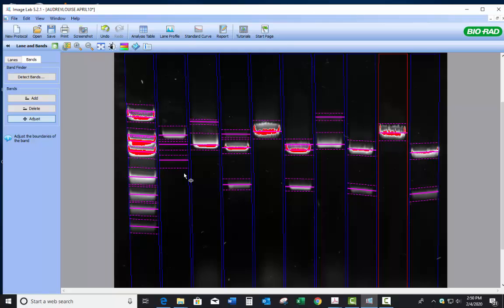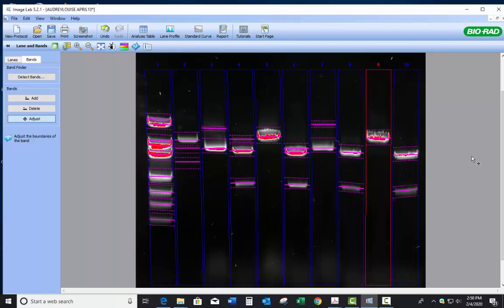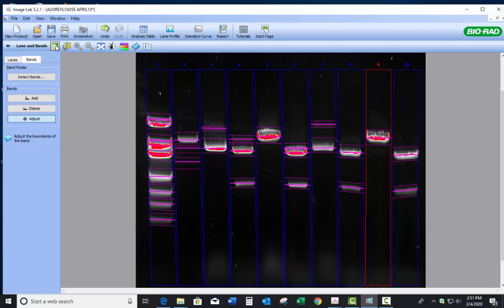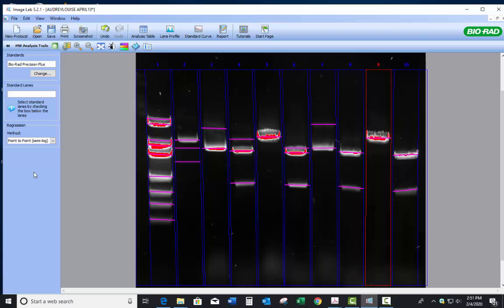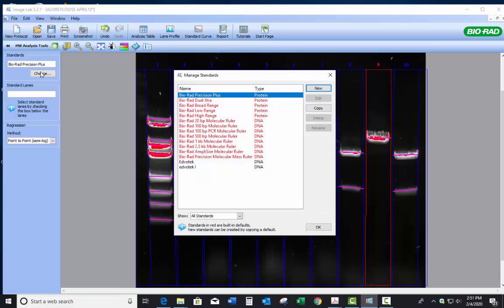And then we'll be ready to move to the next step. Whenever you need to get to the different options over here, it's this arrow right here. Click on that arrow. And now what we're going to do is we're going to do molecular weight analysis tools. By doing that, it's saying the standard that's loaded up is BioRad Precision Plus. That is the protein markers that you used last semester. So let's change that. The gene ruler one kilobase is not in here.